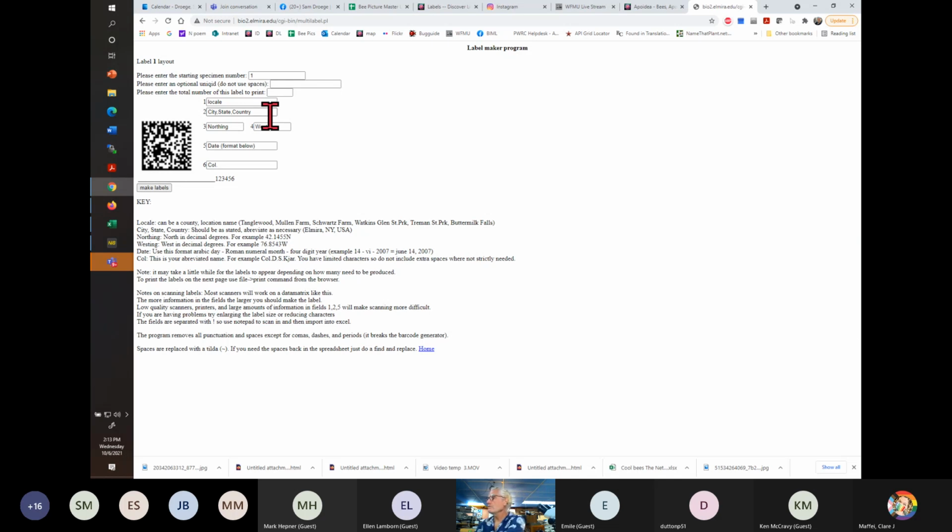And then I use that. I'll do a little screenshot here. I have my common, if I do so much identification, I don't know if you can see that.